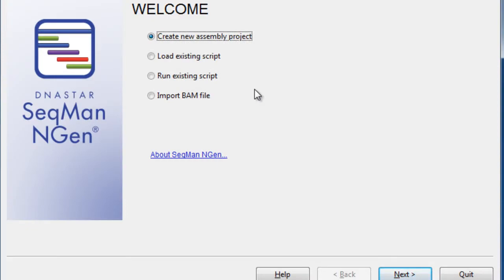In SeqMan NGen, we want to recalculate our verified novel SNPs. By running this assembly, we improve callings at our locations of interest, as well as improving our probability scores.